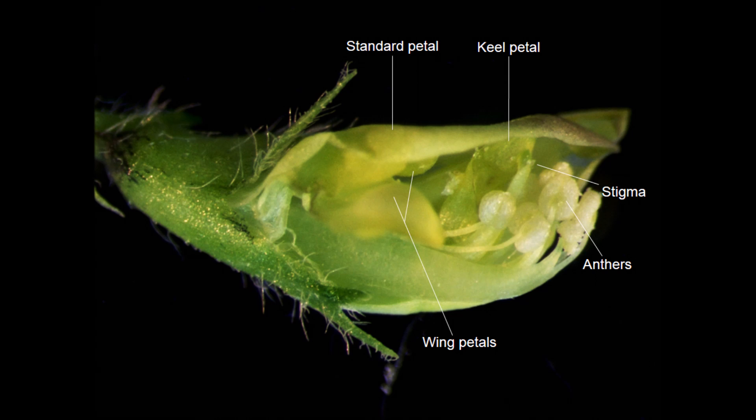In the absence of any intervention, the anthers grow closer to the stigma upon maturity, rupture, and deposit pollen grains on the surface of the stigma, which results in self-pollination. This flower is suitable to use as a female in a genetic cross because the pollen has not yet matured, and thus self-pollination has not yet happened.